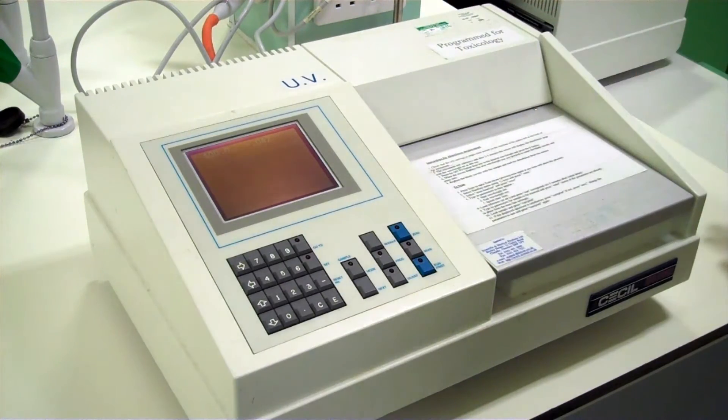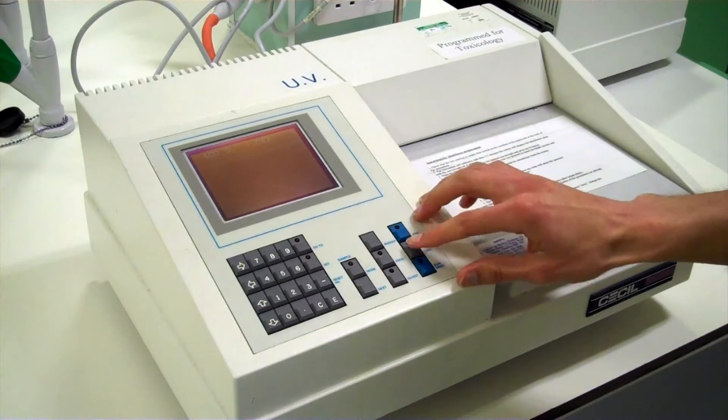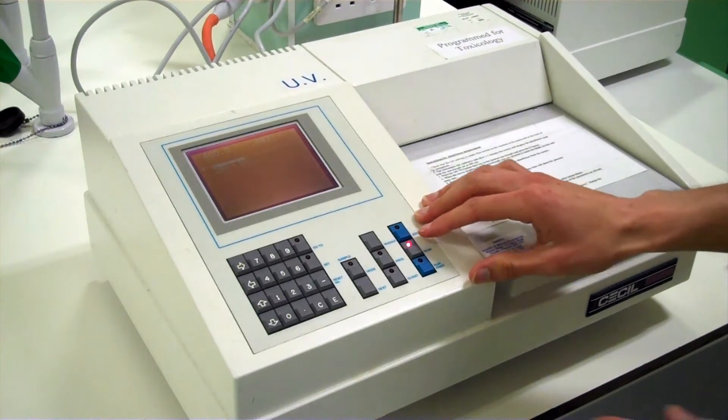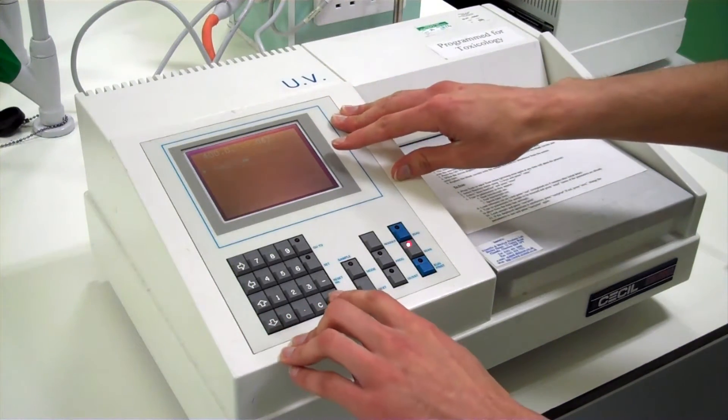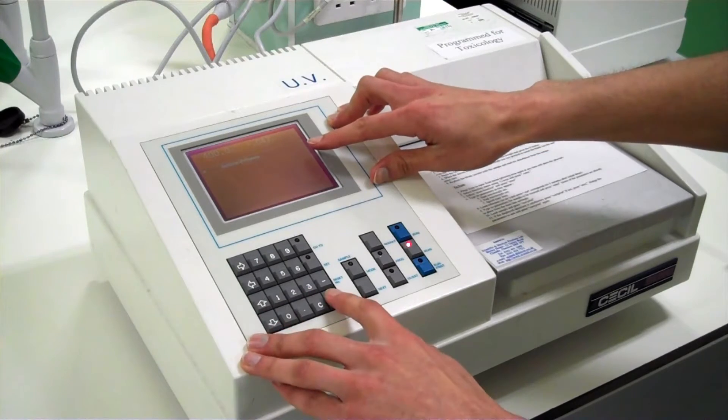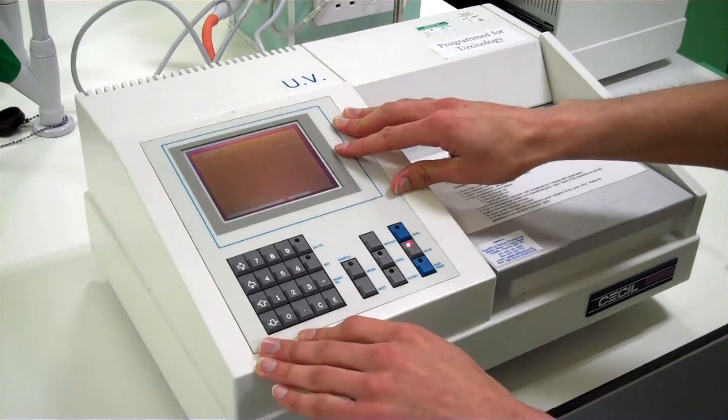To set the baseline of zero with our blank we press the scan button to open up the scan menu. We then go down and select baseline menu then store baseline which will store the absorbance of the blank.